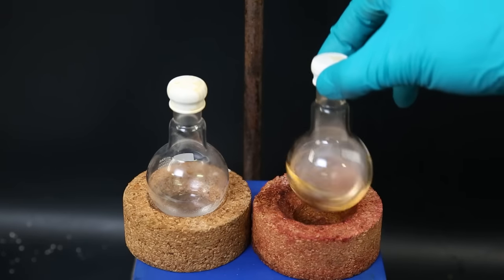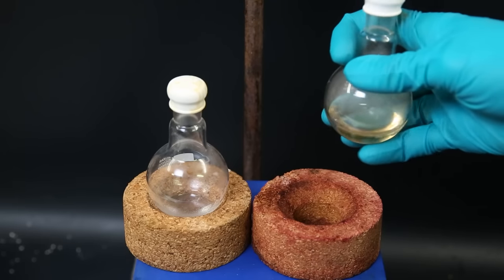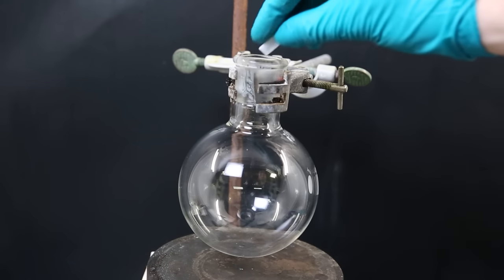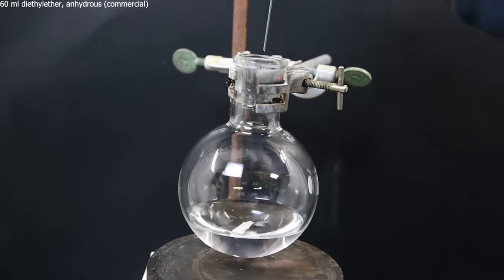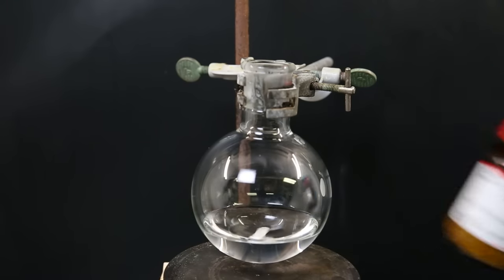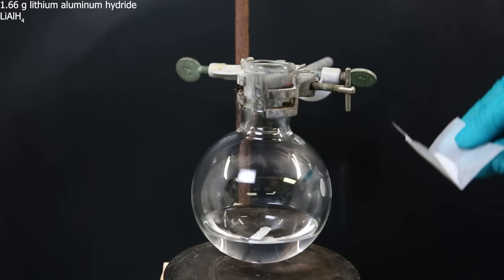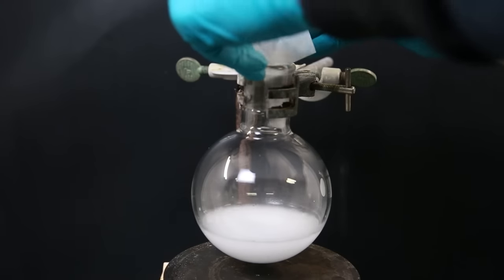Now that I have the tributyl tin chloride, I can move on with the next step, where I will be making tributyl tin hydride. So I set up a flask and drop in a stir bar. I then add 60 ml of anhydrous diethyl ether. Now I will add some lithium aluminum hydride, but it comes in little tablets. So I crushed it into a powder and add 1.66 grams of it to the flask.